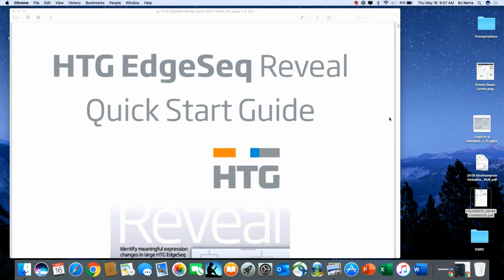Good morning and welcome to a review of the HTG Molecular EdgeSeq Reveal. Reveal is a new pipeline software package that we are offering our customers who work with HTG products that enables them to literally do data analysis at their benchtop or at their laptop.